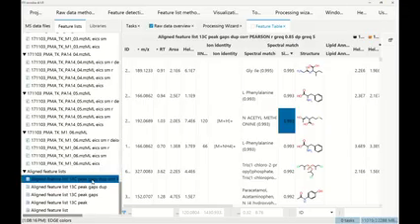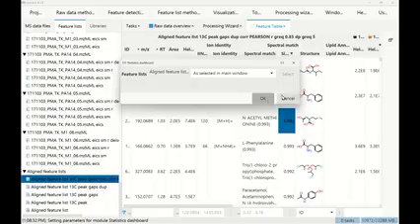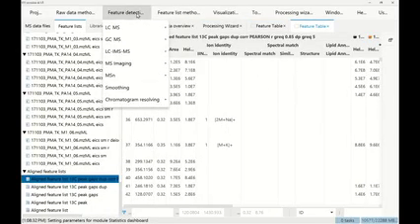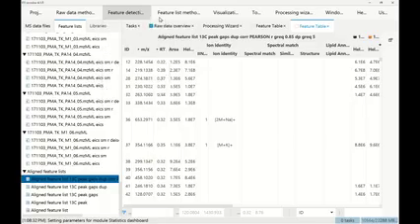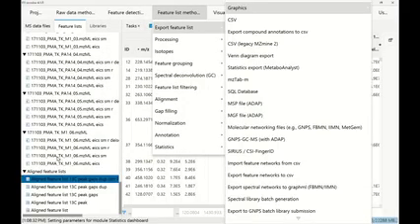And now maybe as a last thing for the hands-on or live demo, we also added a statistics dashboard, and this is very much in development. So how did I get there? You can always try finding it on the top here, but there's a lot of modules that many people have developed and contributed to MZmine.